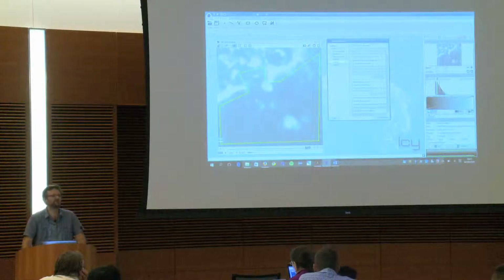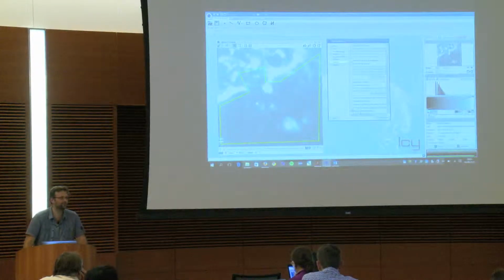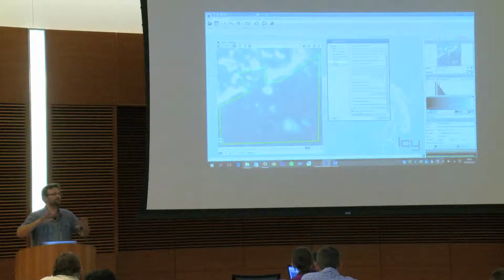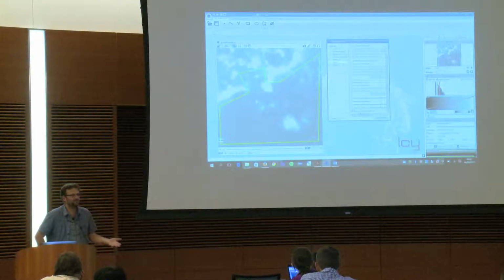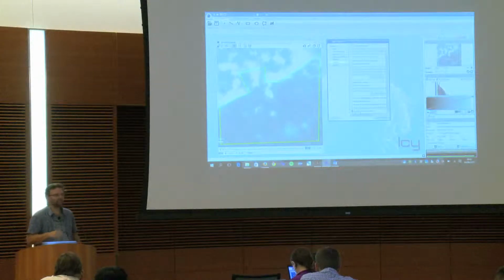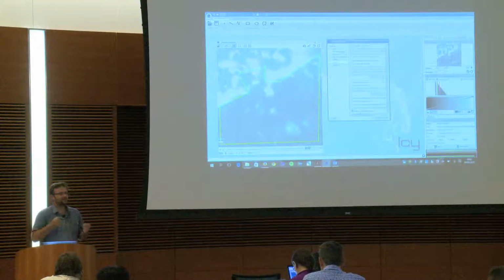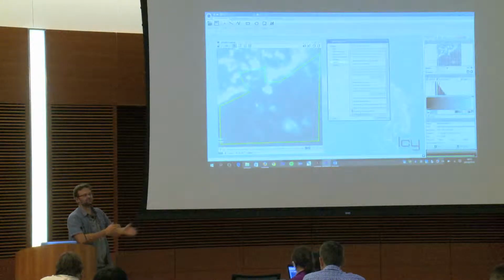And it's cool because I will show you another historical problem that we had in Icy. Here there is something called export to swimming pool. It's a very crappy thing, because before we were able to communicate between plugins, but if a plugin runs something and then is terminated, how can another plugin get the result and play with it? So we created an area called the swimming pool, because we wanted to make a joke. Any plugin can take an object, put a label on it, and throw it into the swimming pool.